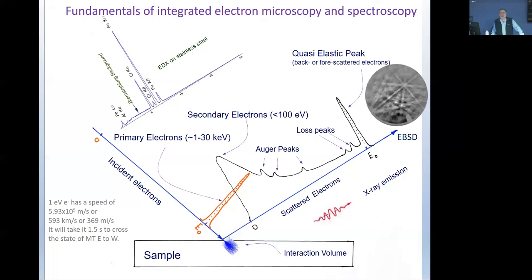Very well. So my question's a little bit more on the practical side. Can you give some suggestions as to elemental analysis when your expected concentrations are relatively low? So when you have maybe 1-2% concentrations, this is more of a signal to noise question, I guess. Yes, thank you for asking that.